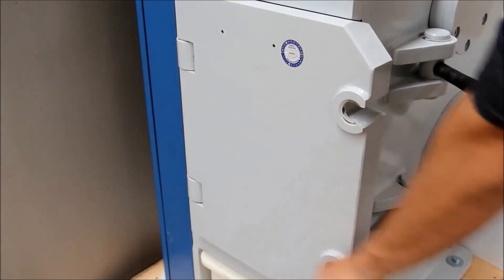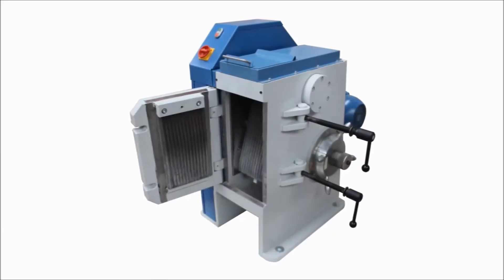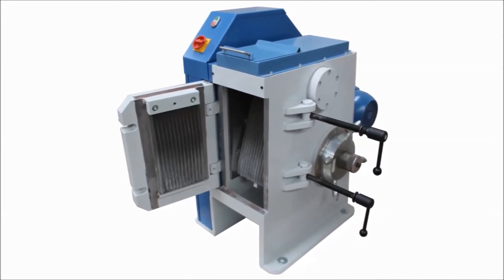The CM20 allows for easy access to the crusher jaws, either for cleaning or to replace the wear plates. Smooth and riffled wear plates are available in different types of material depending on the application.